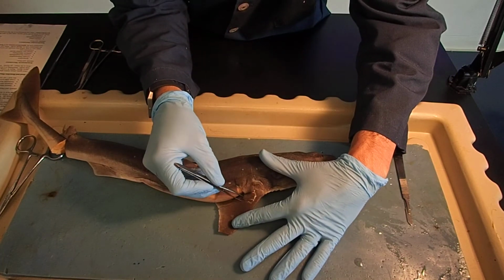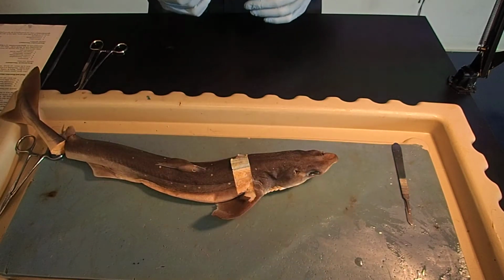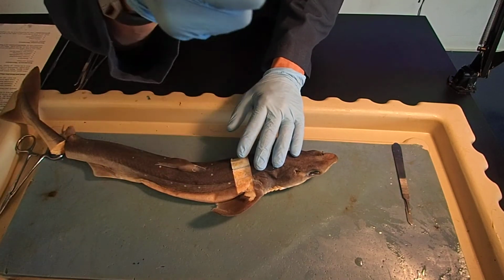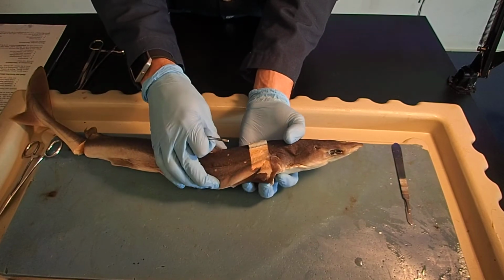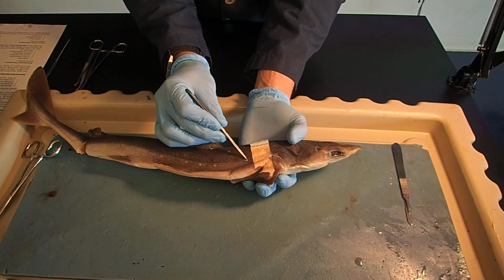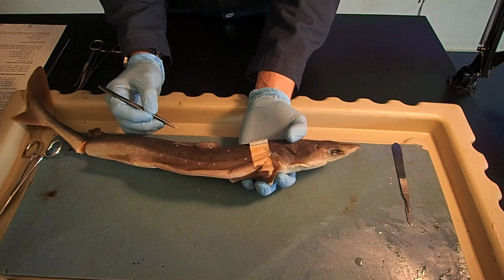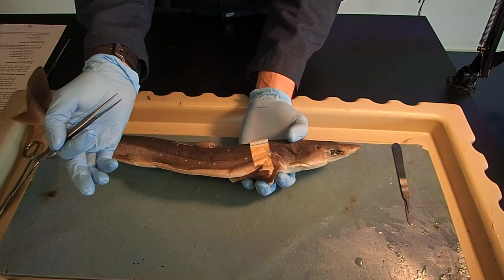So if we take this flap of skin and we bring it up, you're going to notice two different types of muscles. All right. I have two cameras going. I'm hoping you'll be able to see it on this camera that's up close a little bit better. But one of the things that you'll notice right off the bat, before you even look at the muscles, is on this external anatomy, you have this line going down the side here of the shark. Down the lateral side of the shark, on both sides, you have what's called the lateral line. It's a canal that sits underneath of the skin. And there are pores that are connecting that canal underneath the skin to the external environment.